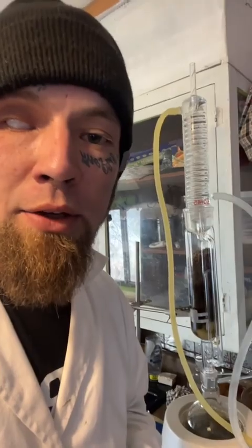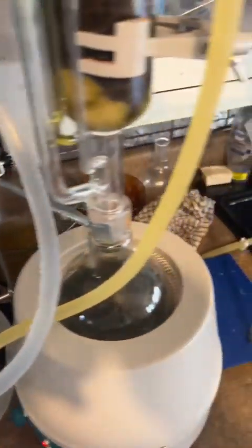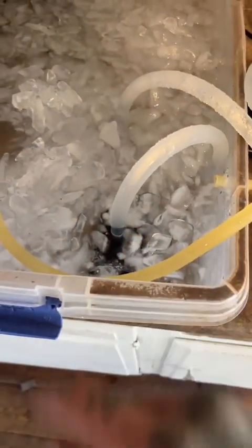I put one of these on my Amazon wish list, which is in my bio — not so everybody can go buy me one, but because I want you to see the exact length of the one that I got. This cost with shipping was about $180. The heat mantle — I suggest getting a digital output so you can get the exact temperature — costs about $200. Make sure you get the size of the flask that you're ordering: 1,000 milliliter. Armatures cost about $25 a piece and you will need two. The pump costs about $20.